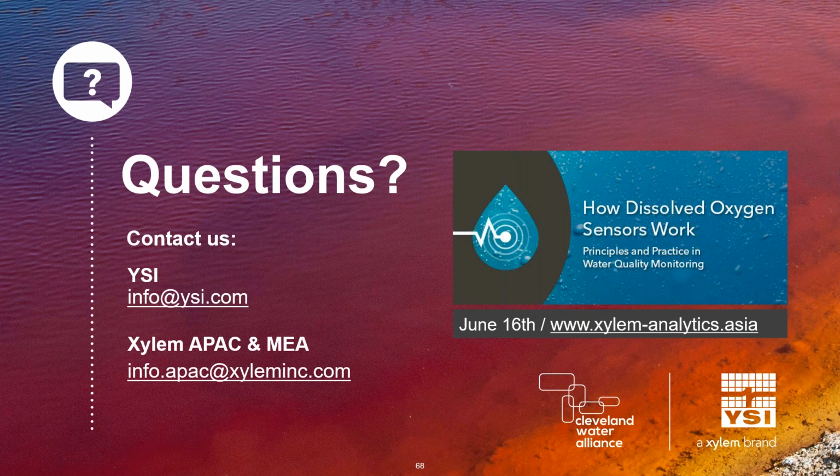Probably daily. Now, if you're doing a spot test, you're probably going to be calibrating pretty often anyhow. If it were a long-term monitoring situation, you'd want to calibrate it every time you get it out there. But with heavily polluted water like that, you can only benefit from calibrating more often.